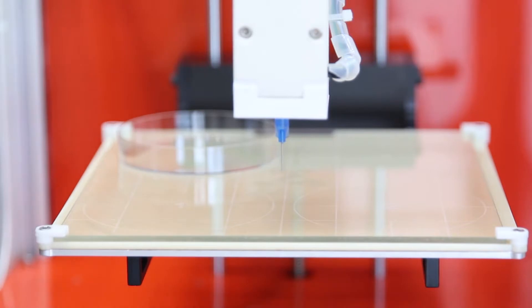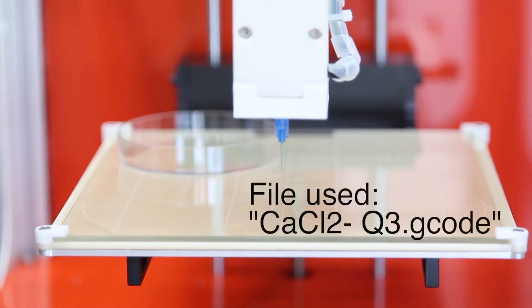Finally, insert your petri dish and print your calcium chloride file.